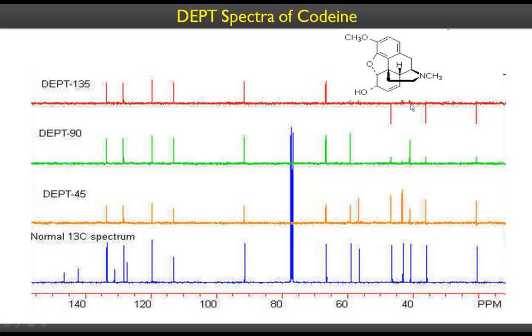methynes. So that is this codeine compound, and there are 3 methylenes, 1, 2, 3, and all methylenes are in the aliphatic region. So that is that methylene, one more methylene, and the other methylene. This is benzylic, so probably I would assign that to that, and this is adjacent to nitrogen, so probably that, and then this H2 is that, okay. And what else do we need to assign here? That's it, right? Methyls, okay.